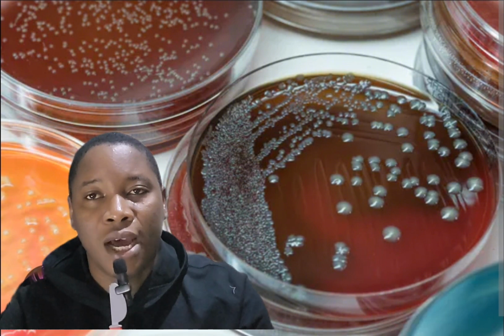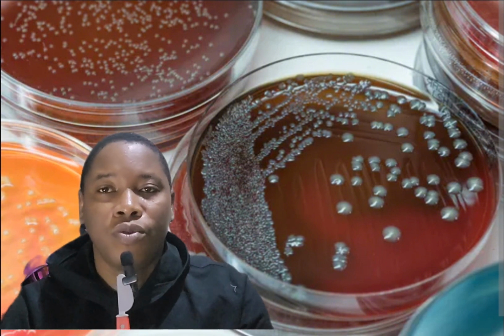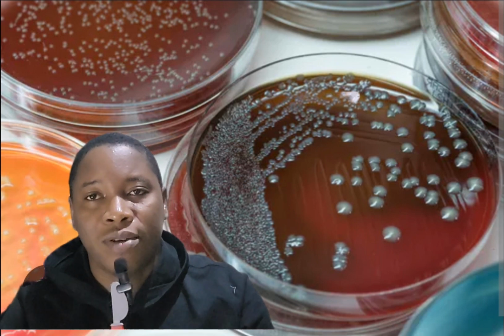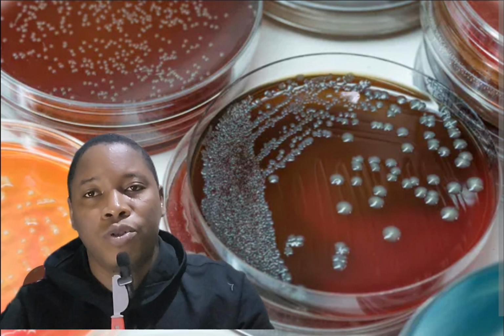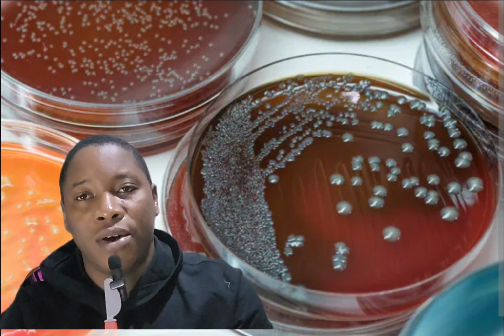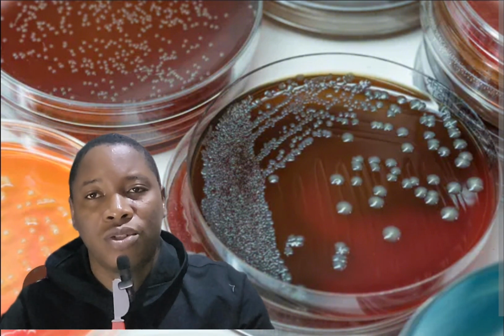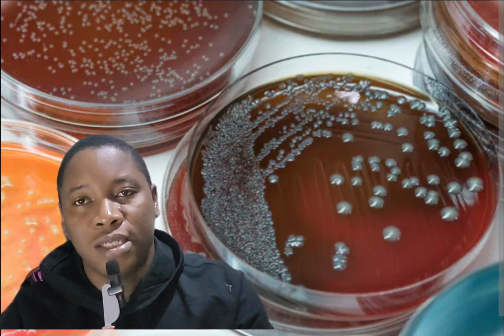And these cultures are important because the reason why you want to do this is that you want to be able to study these bacteria, study these microorganisms under different conditions. You want to be able to determine what are their energy sources. Do they grow under oxygen? Do they not grow under oxygen? So there are various questions that you want to be able to interrogate these organisms.